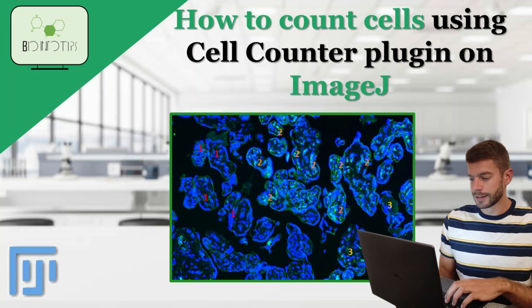Do you want to know how to use the Cell Counter Plugin on ImageJ? You came to the right place. Welcome back to BioInfo Tips.